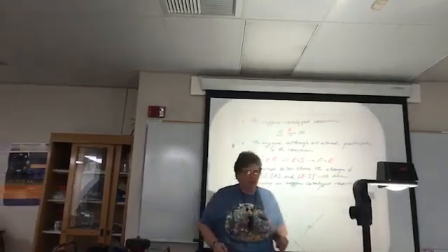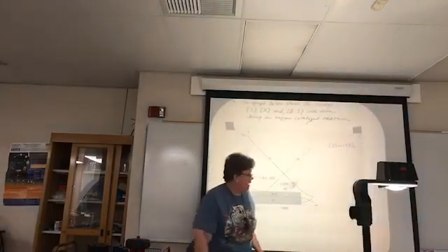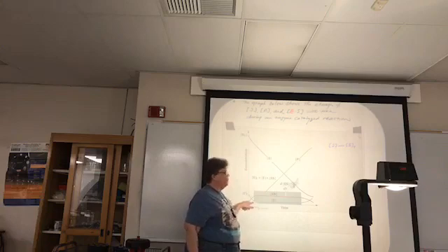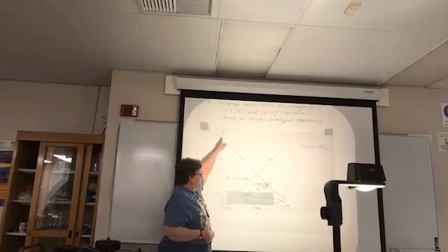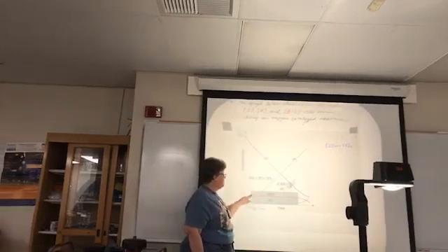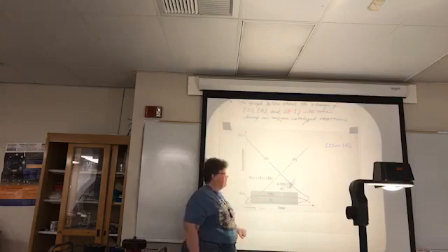So generally, what's happening in the reaction in this idea of steady state kinetics is that you have a very high concentration of substrate at the beginning, and you have no product at the very beginning of the reaction. As soon as you add the enzyme to your substrate, which is going to include the presence of NADH as needed, the concentration of substrate starts to drop because the free enzyme that was there at the beginning of the reaction now grabs some of that substrate, and as it grabs that substrate, it starts turning it into product. So the level of product starts going up as the level of substrate is going down.